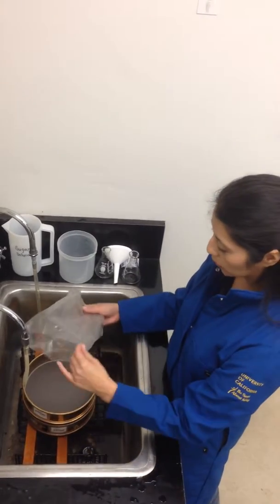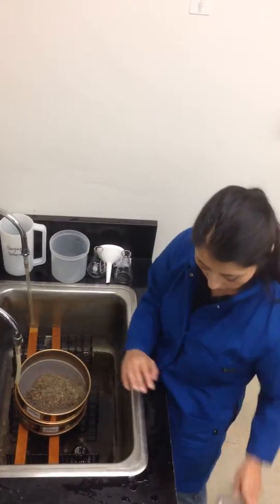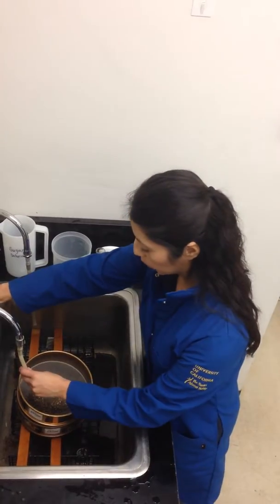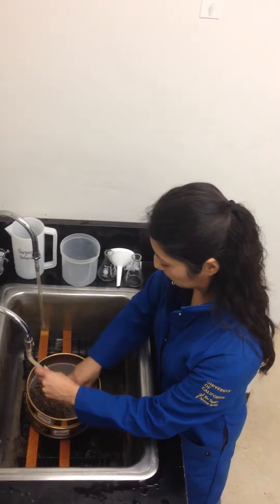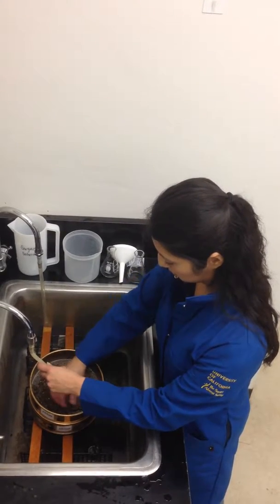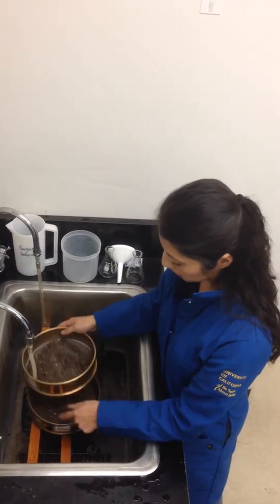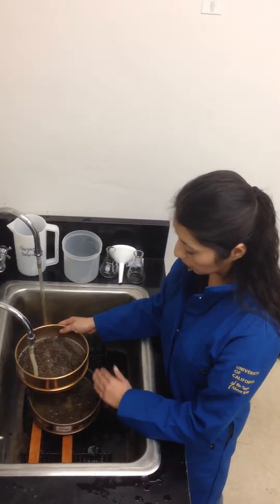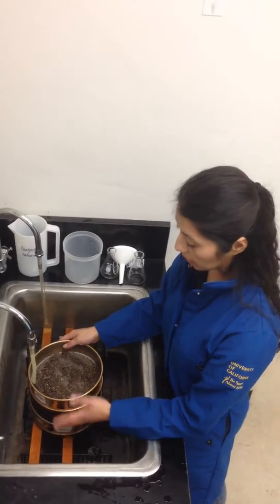We're going to add the soil to the coarse sieve. Then we're going to wash it carefully, making sure every so often that the bottom sieve is not getting full with water, because the sclerotia can float and they can get lost.